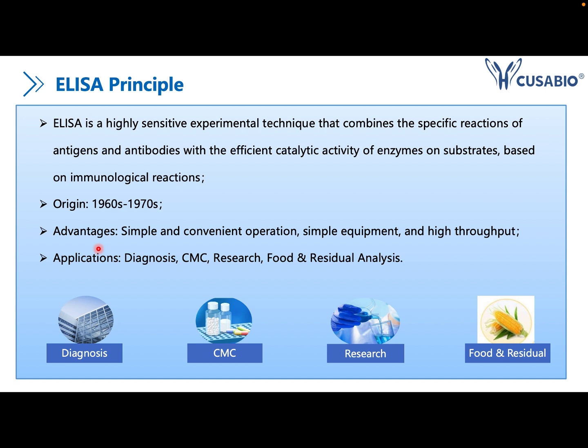ELISA is a simple and convenient operation, and the equipment is quite simple. You can also do ELISA testing in a high throughput manner. ELISA can be used for many diverse applications like diagnosis, CMC, research, and analysis of food and residues.